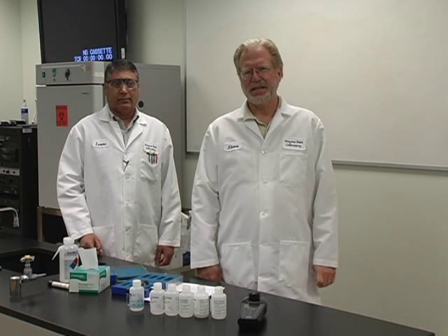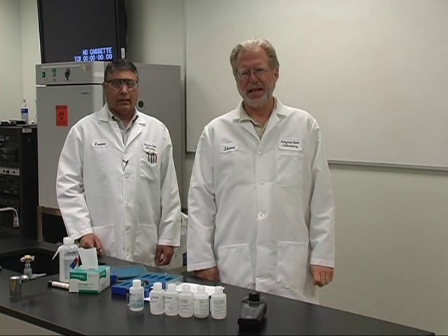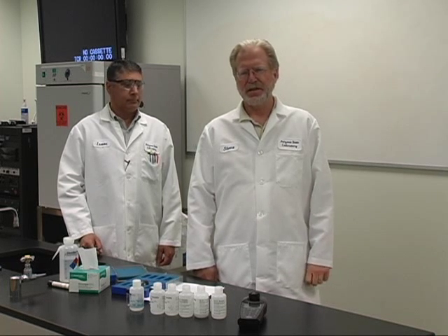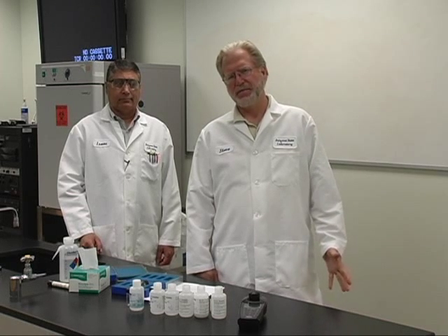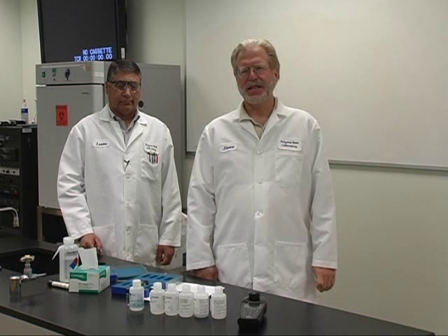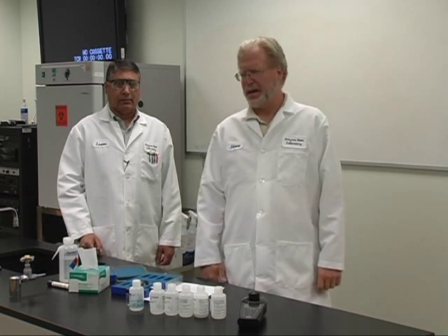Isaac was the former inorganic chemistry manager here at the state public health laboratory for 23 years. In that role, he also ran turbidity, wet chemistry, and metals. Isaac is the current lab licensure manager for us here at the state laboratory.